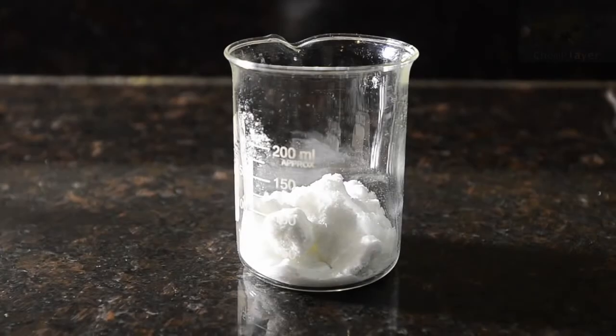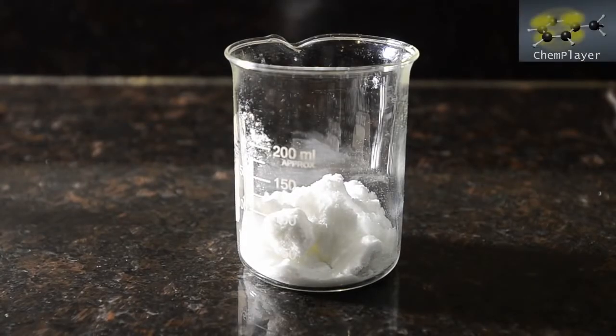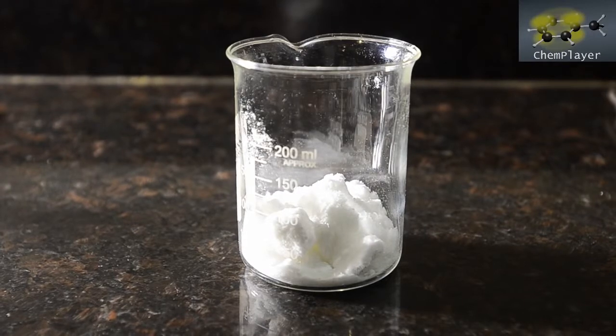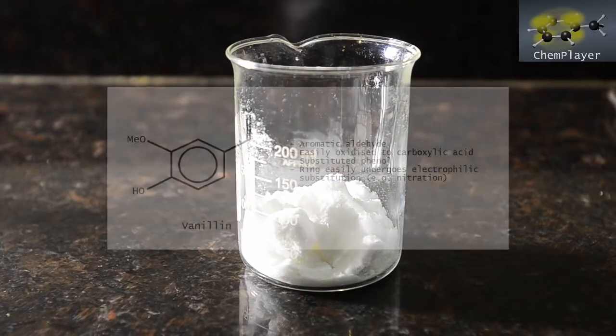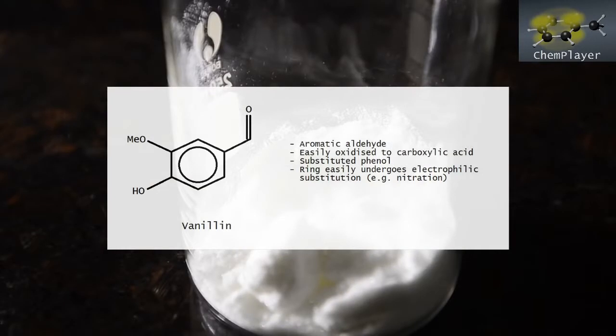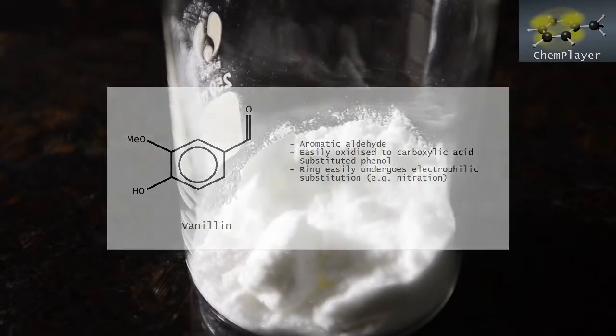We wanted to try out the nitration of vanillin, but we couldn't find a procedure. So we figured we'd have a go at making one up. Vanillin is a phenol, so the aromatic ring is pretty activated towards electrophilic attack. So nitration should be pretty easy. With phenol, for instance, dilute nitric acid will nitrate very readily.